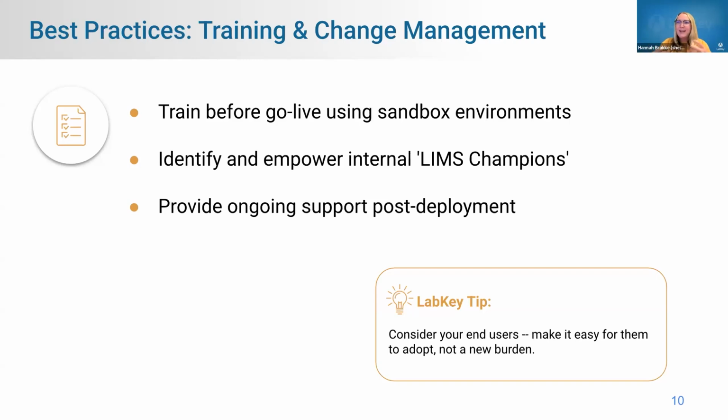There's a lot of stress that happens around change that regardless of how good your LIMS system is, regardless of how well you've performed these integrations and things like that, if you're not managing that people aspect, it tends to start to drag or you start to get resistance or concerns from people about your new LIMS. And so making sure that there's plenty of time to do training sessions, and also having that support for people as they have questions too, before they're really in the production environment, with a pipette and gloves on the bench and they don't know how to enter something into your system.